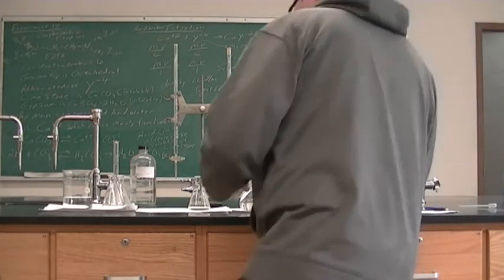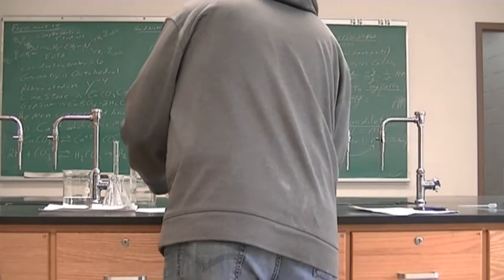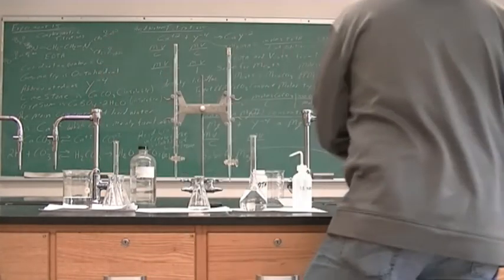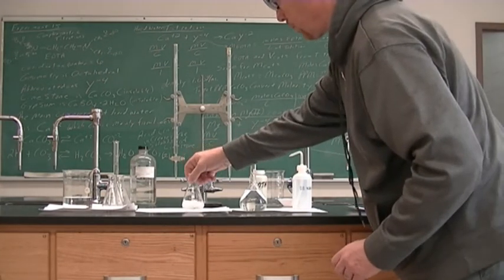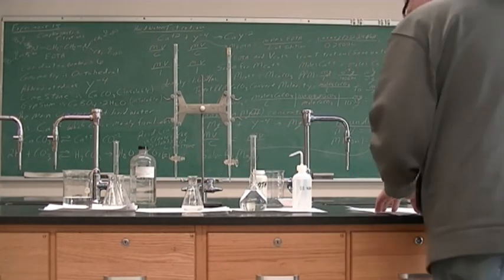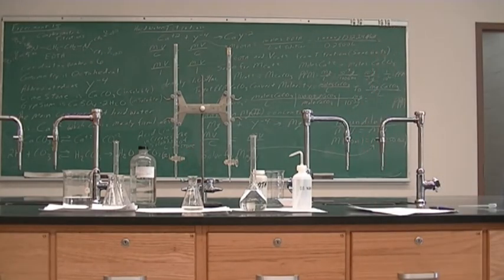So we're going to add 0.2 grams of ascorbic acid. We're going to add 1 ml of pH 10 buffer.